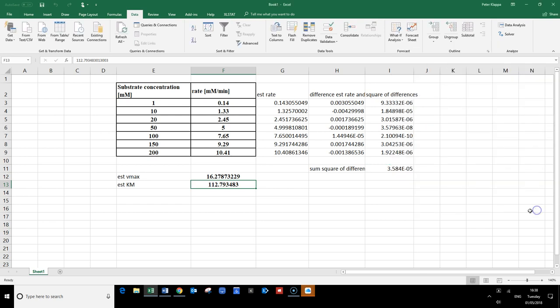I hope this makes life a lot easier when you have to analyze enzyme data. You can use this approach for whatever data you want to analyze: calculate values from your equation, compare them to observed data, take the differences, square them, and invoke Solver to do the rest. I hope this makes sense — you can use this wonderful Excel add-in for future enzyme analysis studies. Thank you very much for watching.